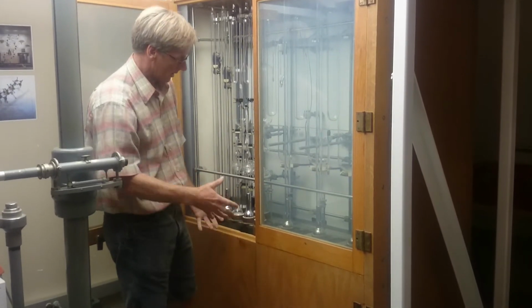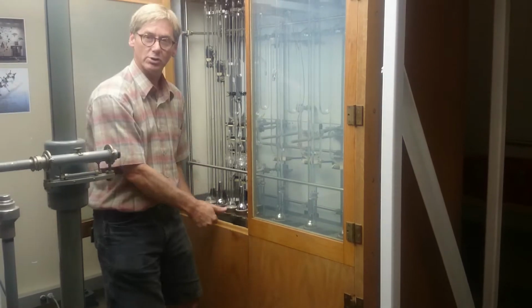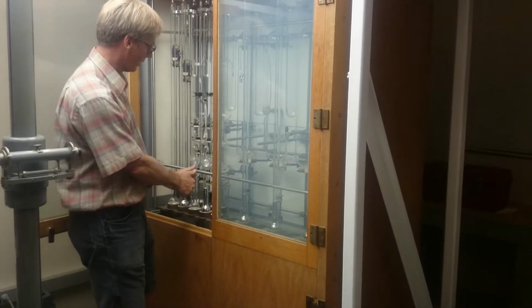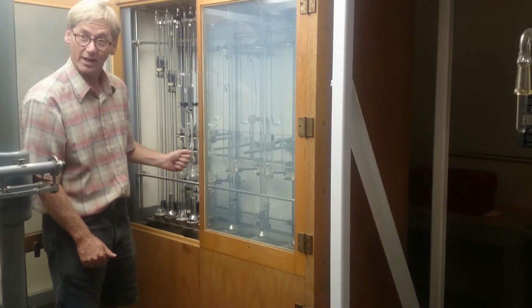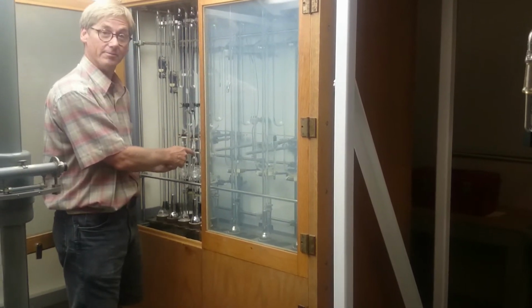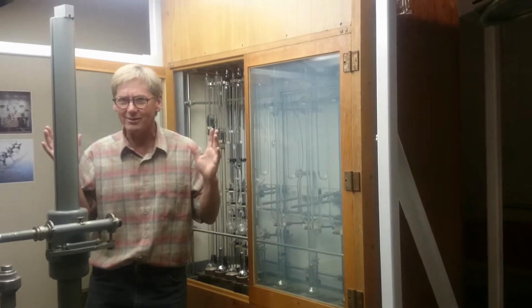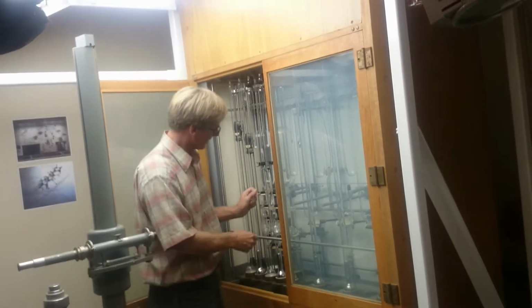And then this mercury is all connected underneath, and so you can pump on it and push the levels up. So you basically control the levels. Phenomenal. So you push the mercury up until it comes to this pointer right here inside. And that pointer established a very particular volume, a volume of 4.127 0856 cc's. That's one of the first things I had to do. You went to a lot of trouble to figure out how big that was. Okay, that was important. There was a lot of trouble.